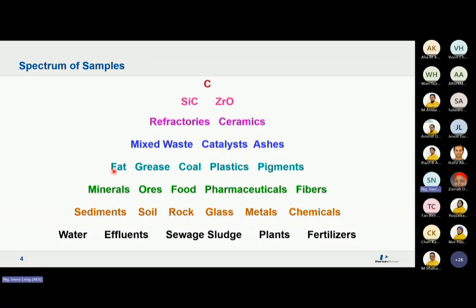But if we say lubricant oil, when we go through this topic, not necessarily every time you must digest your sample to become aqueous. If we are doing lubricant oil analysis, we would like to avoid digestion, because digestion always will have a very long waiting time in the sample prep. But in lubricant oil or palm oil analysis, we are doing a dilution. We dilute with the solvent. So not necessarily you would like to convert it to become a liquid aqueous form to run.